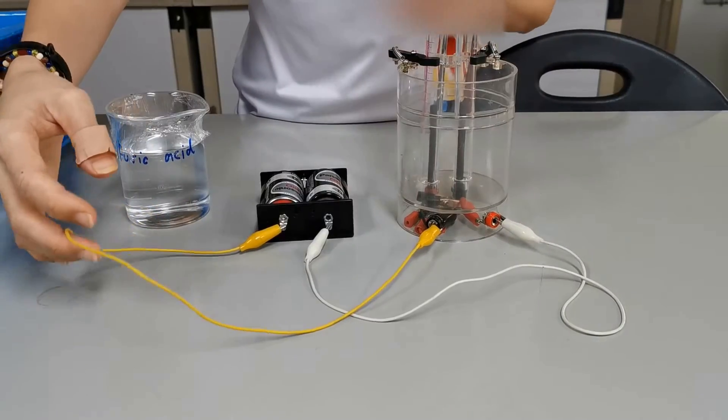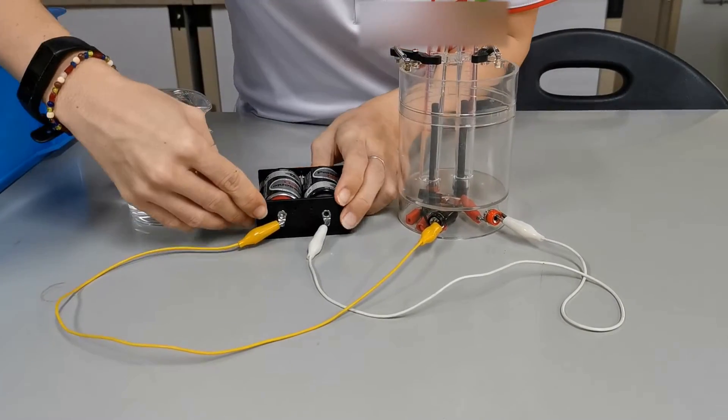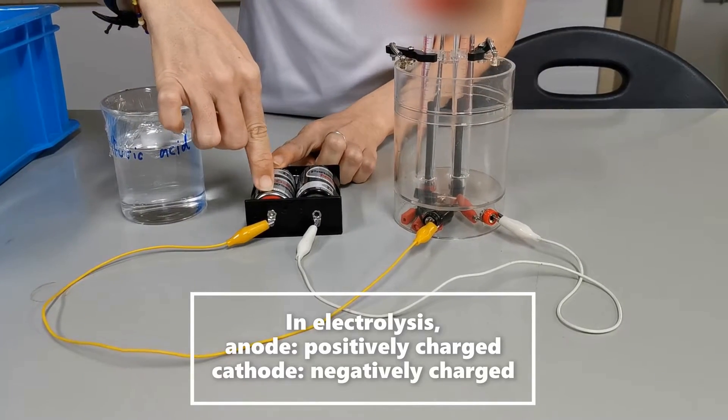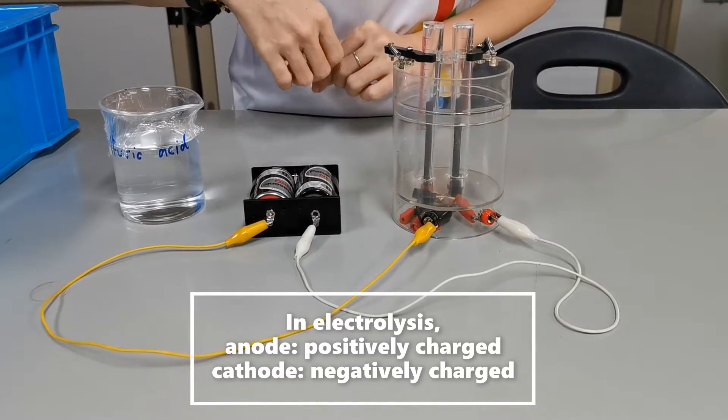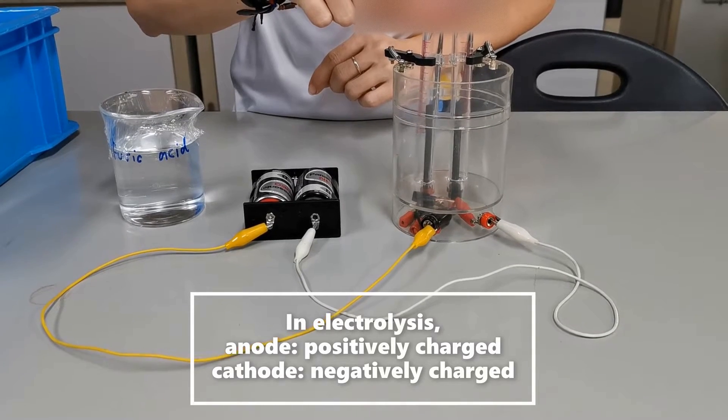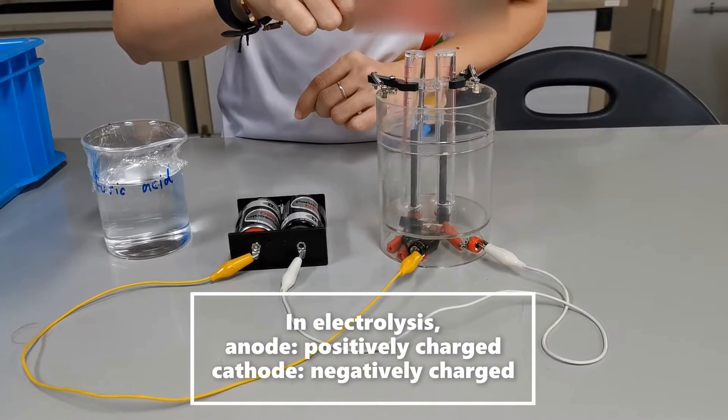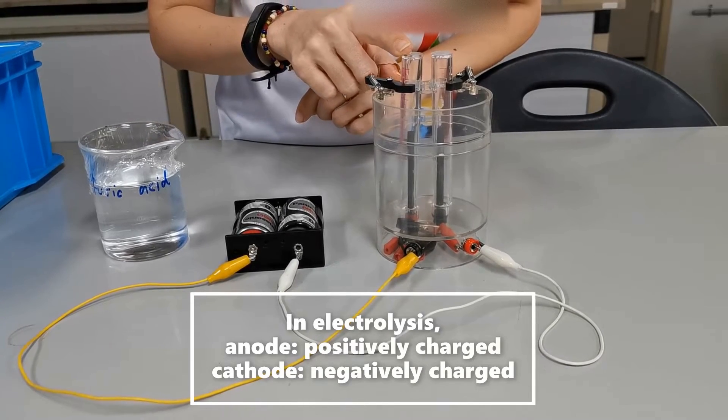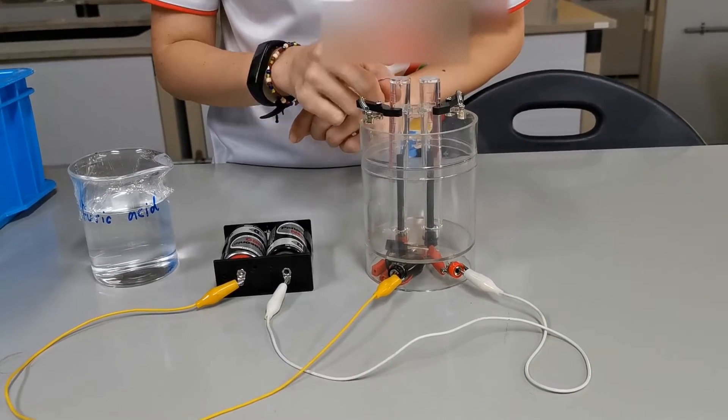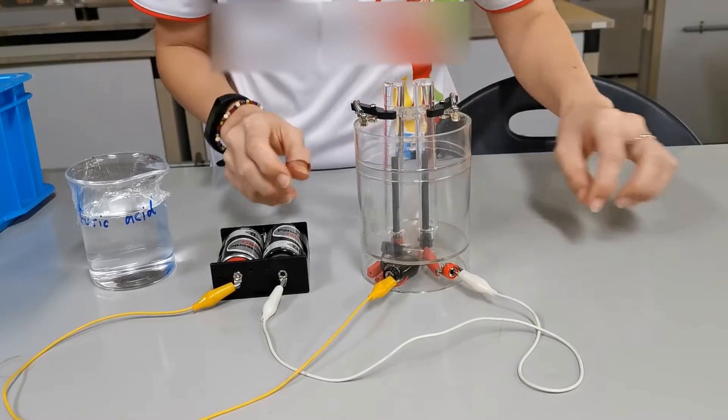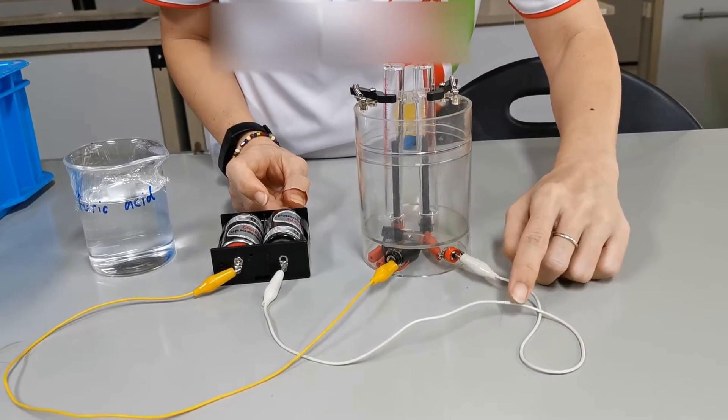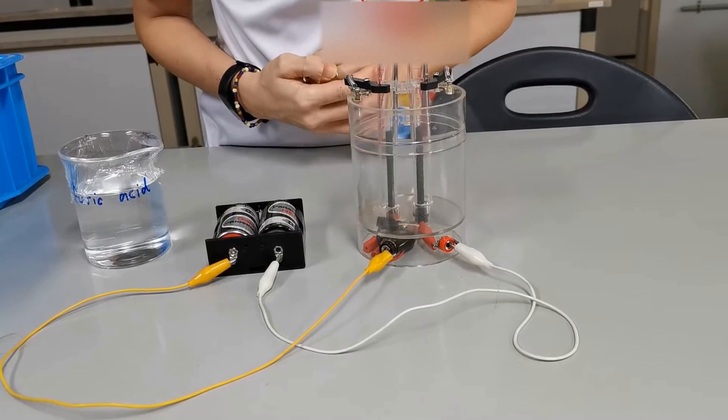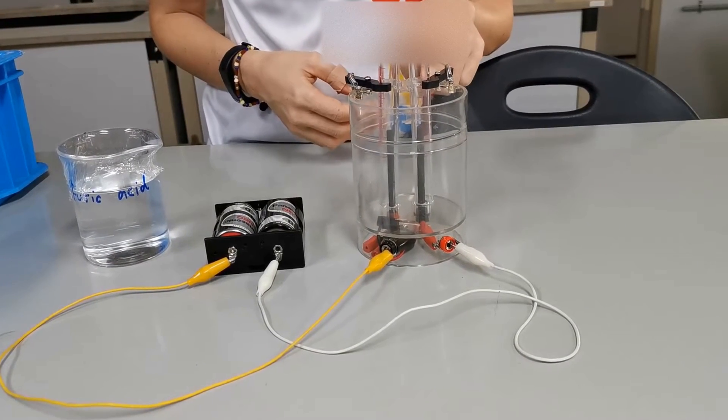The electrode that is connected to the yellow cable is positively charged because it's connected to the positive terminal of the battery, so this is going to be our anode. Positively charged electrodes are called anodes because they attract anions. And the electrode that's connected to the white cable is negatively charged, so we call this our cathode.